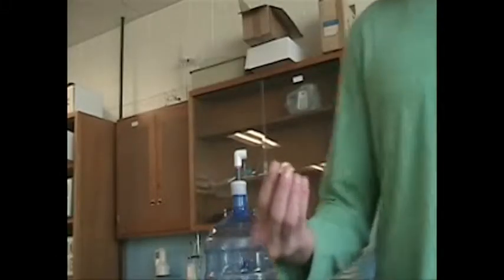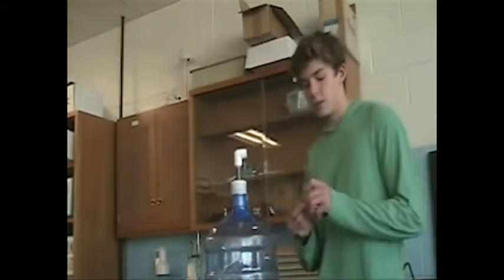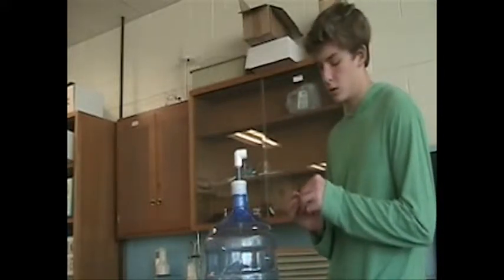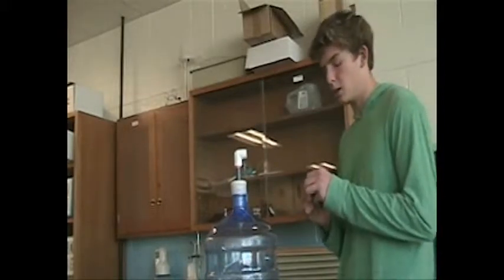And now we've got this elbow piece on there so that we can connect this to further airflow pieces and pump some air into this bad boy. Right here we've got a 1/2 inch to 1/4 inch male-female adapter, and we're going to put this onto the elbow piece. Use some plumber's tape to make sure it's watertight, and Noah's going to help me again just to make sure we don't apply too much torque to the rest of the piece and cause anything to break.